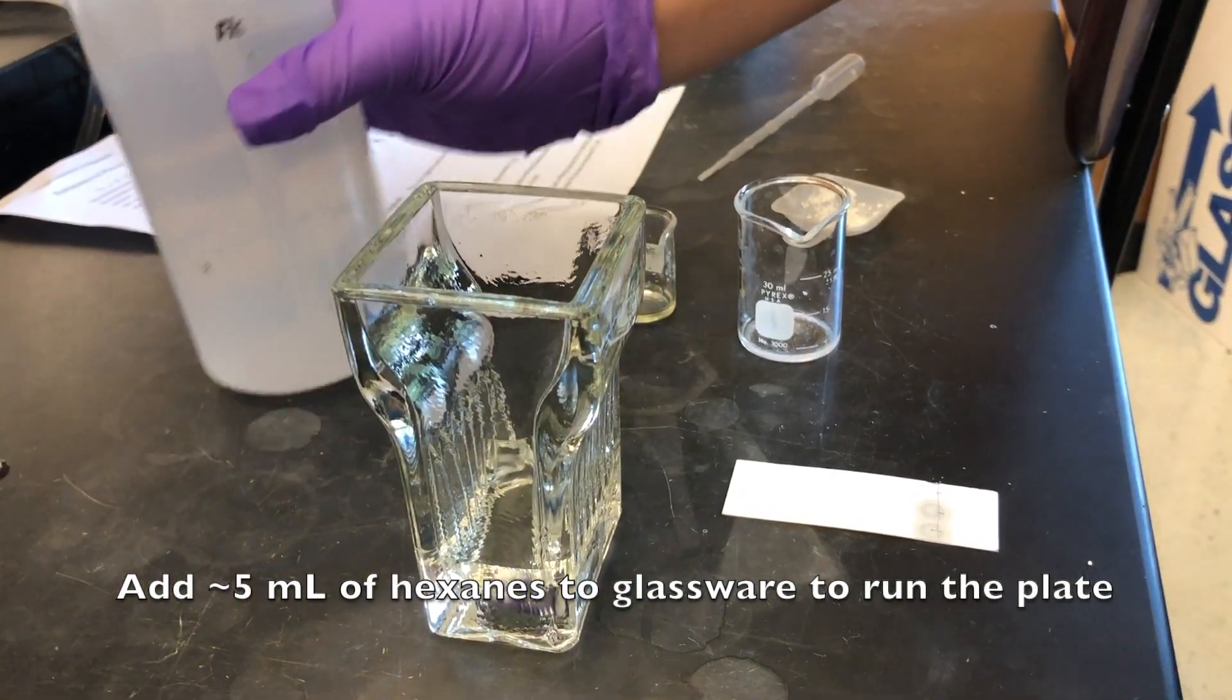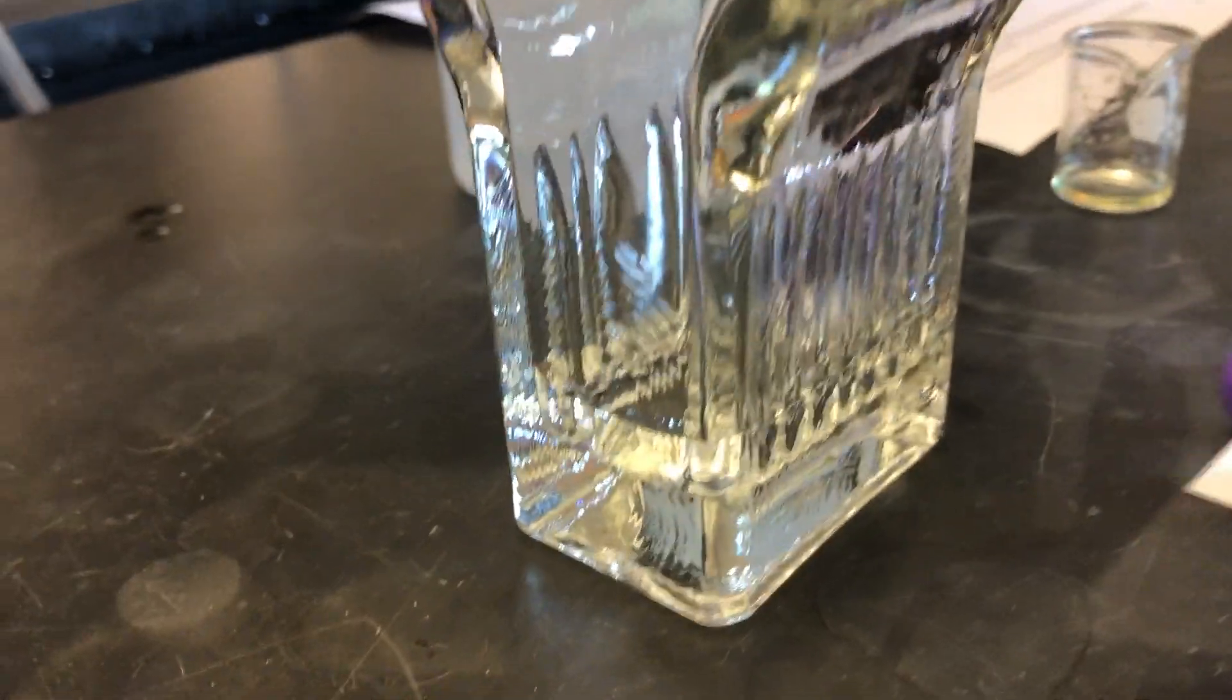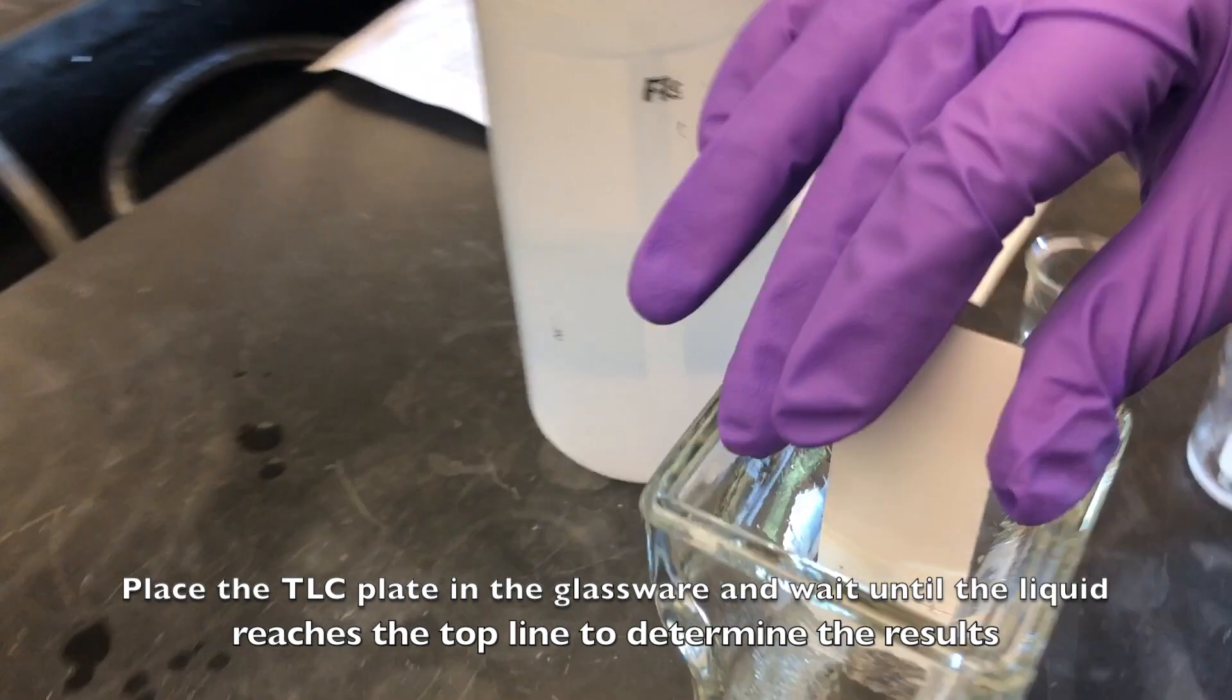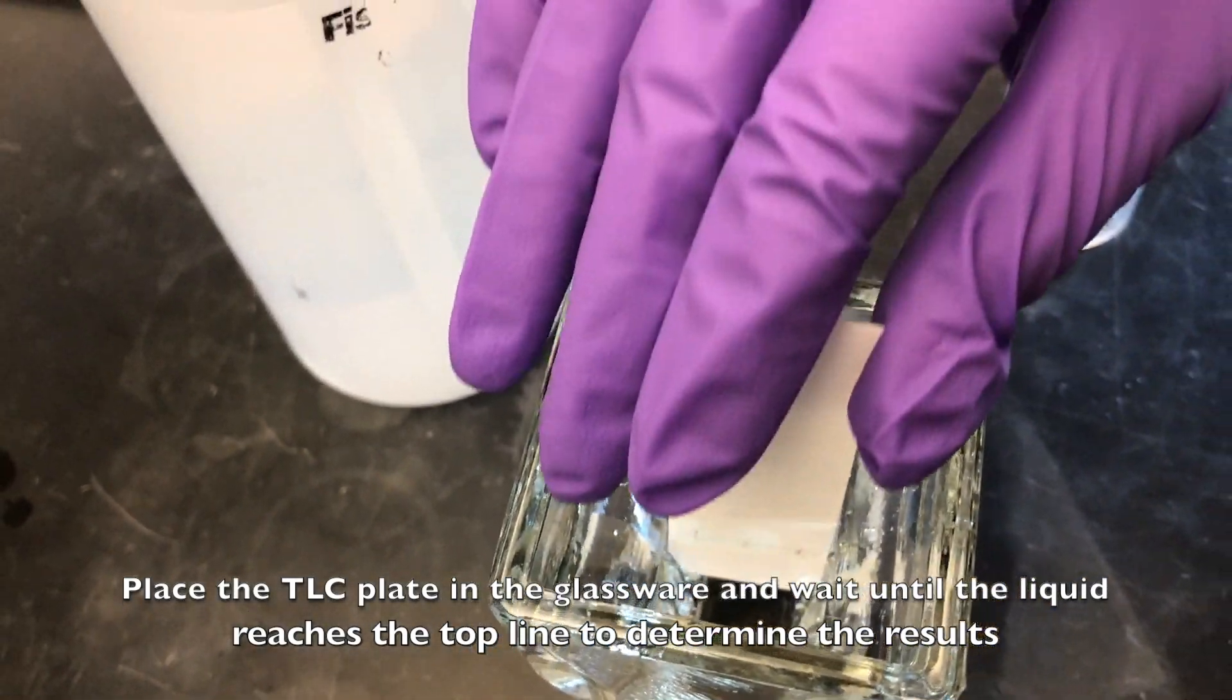Add 5 milliliters of hexanes to the glassware to run the plate. Place the TLC plate in the glassware and wait until the liquid reaches the top line to determine the results.